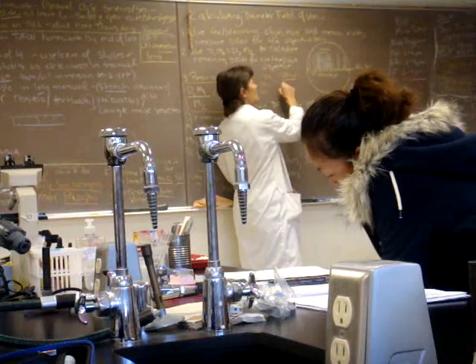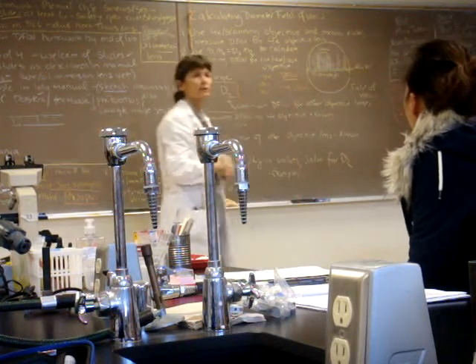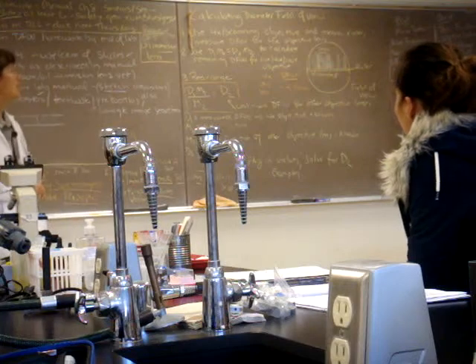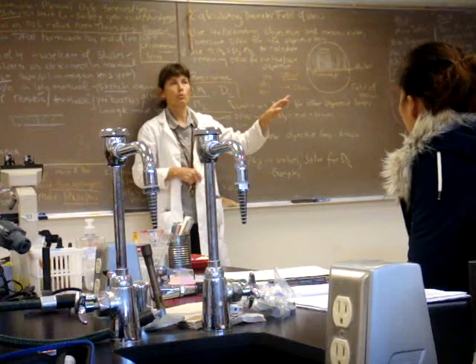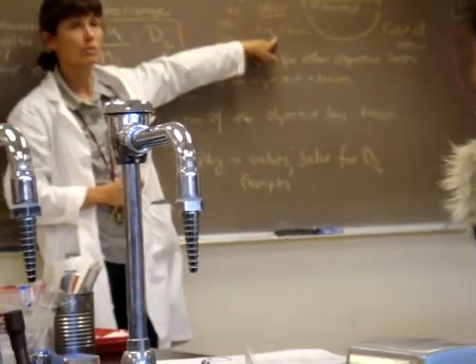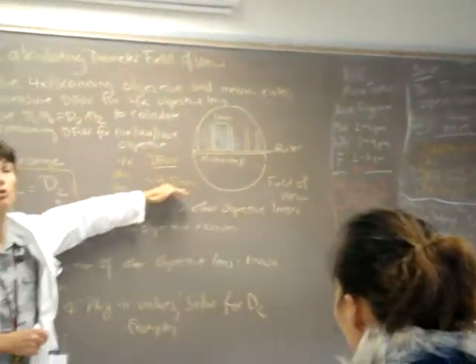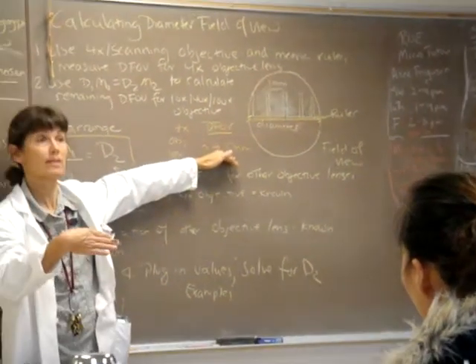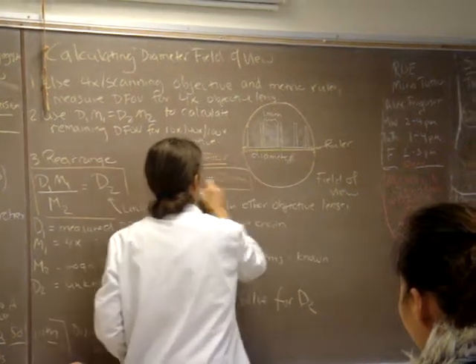is what? 4.5. We'll just go ahead and make our lives easier. Say about 4.5 millimeters. You okay with that? Okay. Now, these values, you guys, will never change for your scope. Okay? And remember, you guys, you need to measure this yourself on your microscope because yours might be different. Once you've measured the diameter of the field of view with your 4x objective, it will never change for your scope. So these are constants, right? 4x is constant, 4.5 millimeter is a constant.